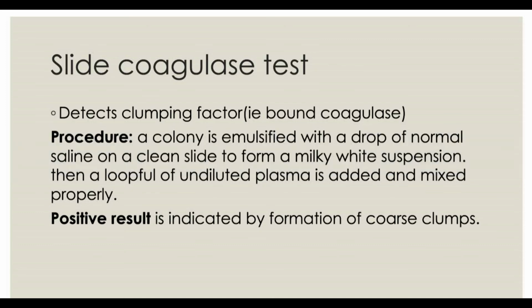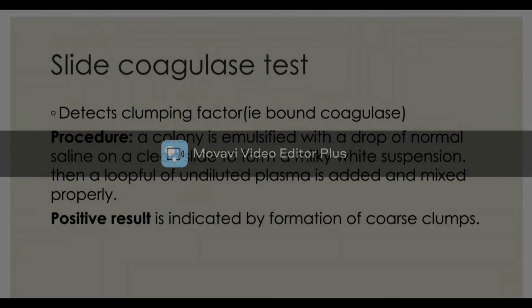And the positive result is indicated by the formation of coarse clumps. And that's for the slide coagulase test.